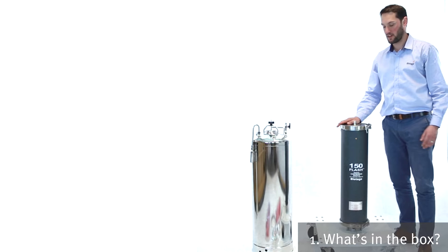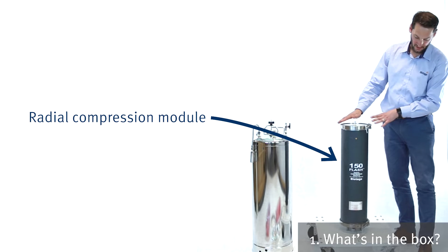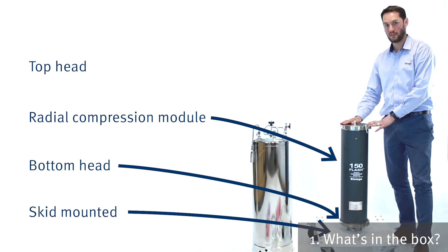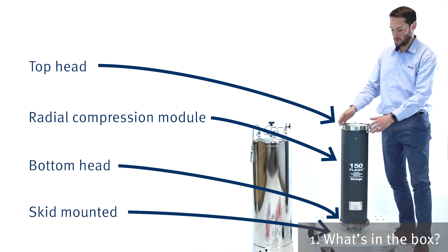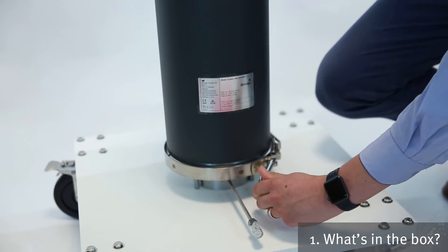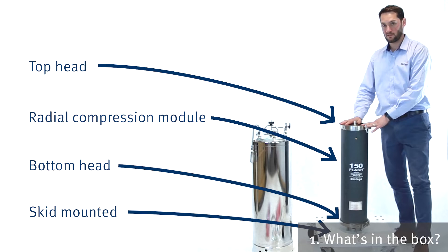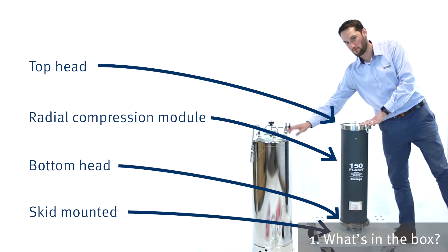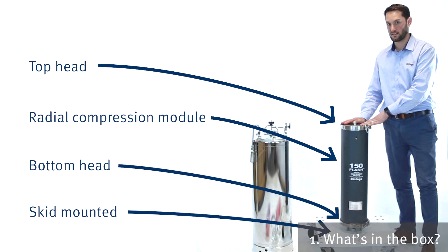On this side we've got the radial compression module. It's all mounted on a skid. We've got the bottom head and the top head. Those are both sealed onto the radial compression module with these V-band clamps. This is going to be pressurized, squeezing the cartridge that sits inside it, and then we're going to pump the solvent through from the 60 liter solvent reservoir.